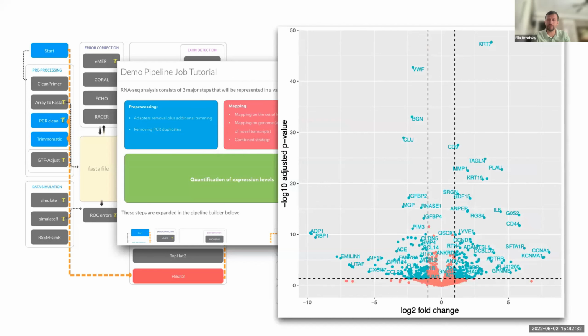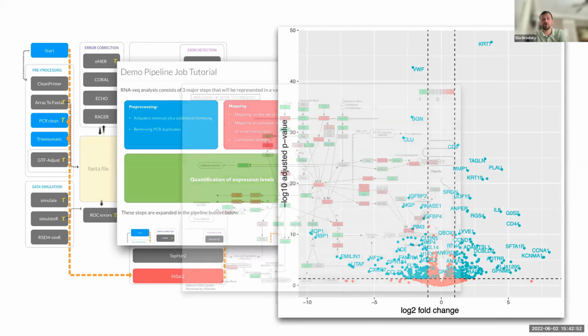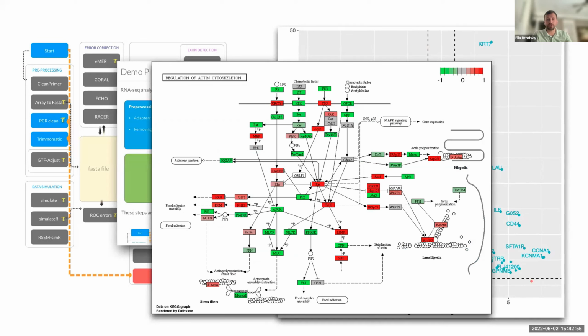So in the most simple experiment, you will have several replicates in one condition, several replicates in another condition, and because they have been produced in a controlled way, you can make biological interpretation based on these differentially expressed genes. And we'll talk about plotting, volcano plots, and things like that, but also about downstream interpretation. How do we connect those differentially expressed genes with gene sets, like pathways, gene ontologies, etc.? And how do we make sense of what's actually going on?